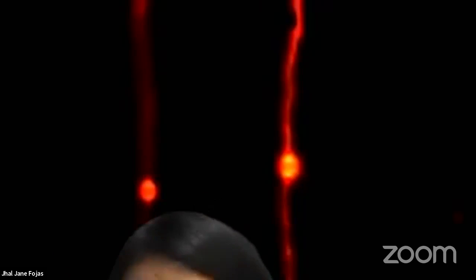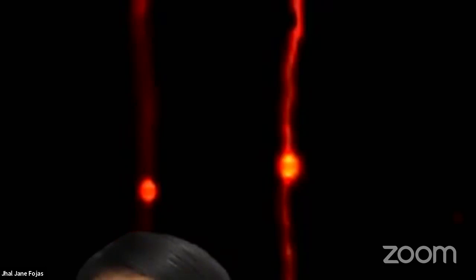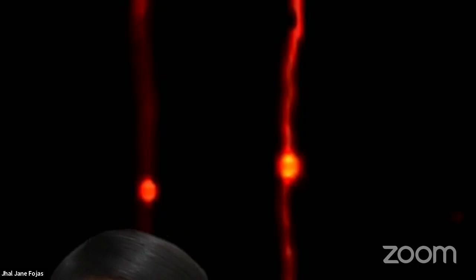So that's the neurons, actually, that's the axon. You see it firing really nicely. And if you see these really bright red lines, those are the axons, and those are in channels. That's why you see them separately. I managed to culture individual neurons and image the individual axon. It's quite fascinating really to see this. Anyway, I'll turn off my video because my internet is not as stable.